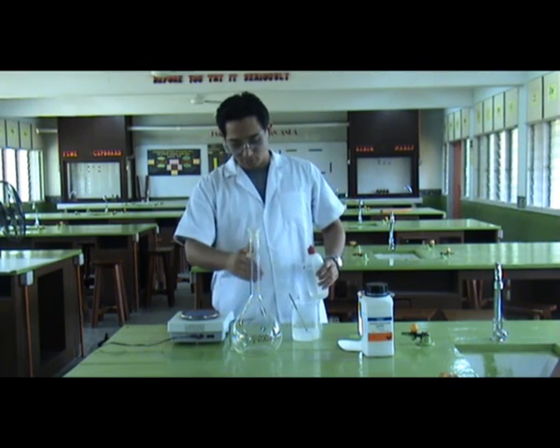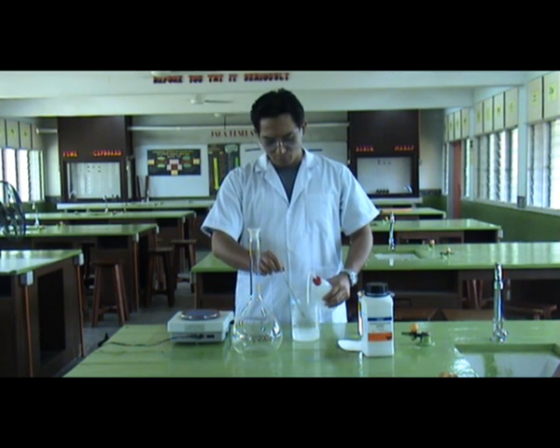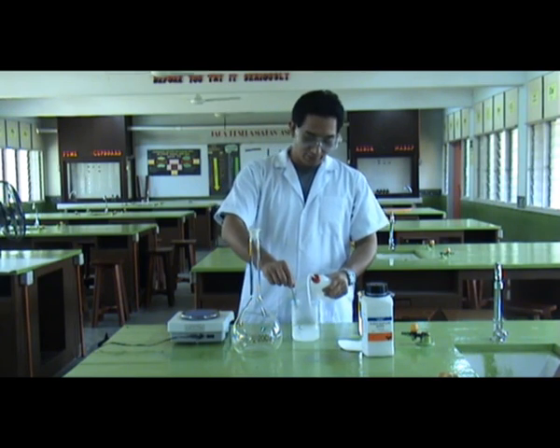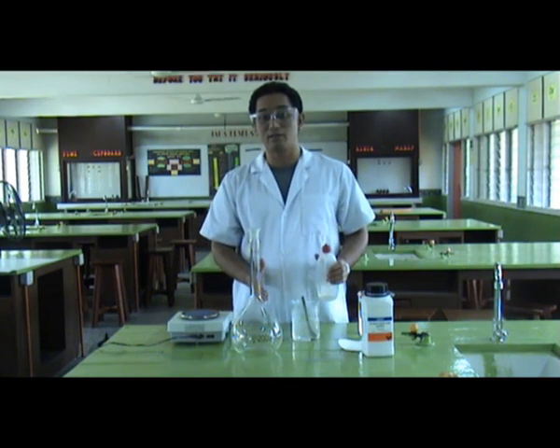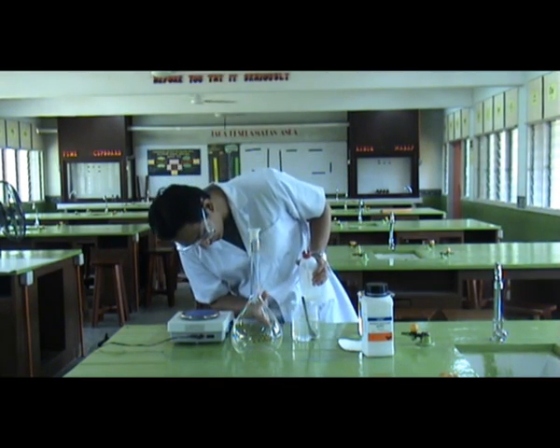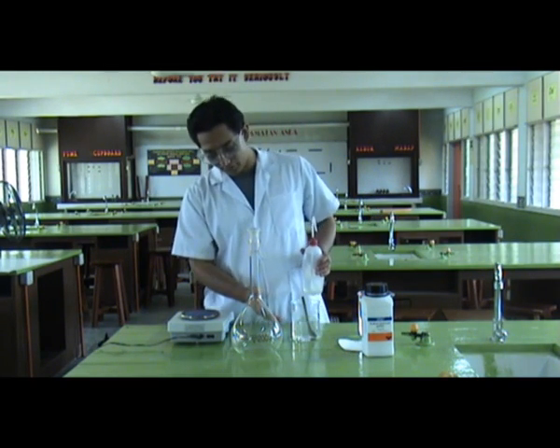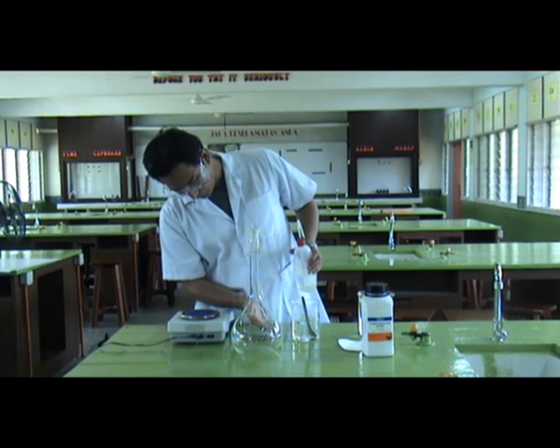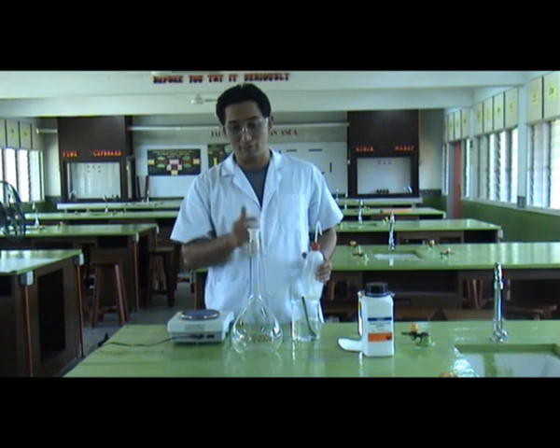Be careful, because when you add water into sodium hydroxide it will put out fumes. We must add more water until it reaches 500 ml, which is half a litre. So remember, we must add water until it reaches 500 ml.